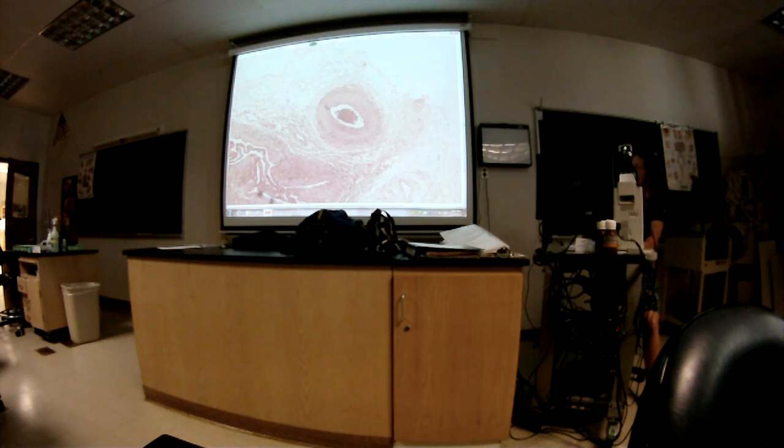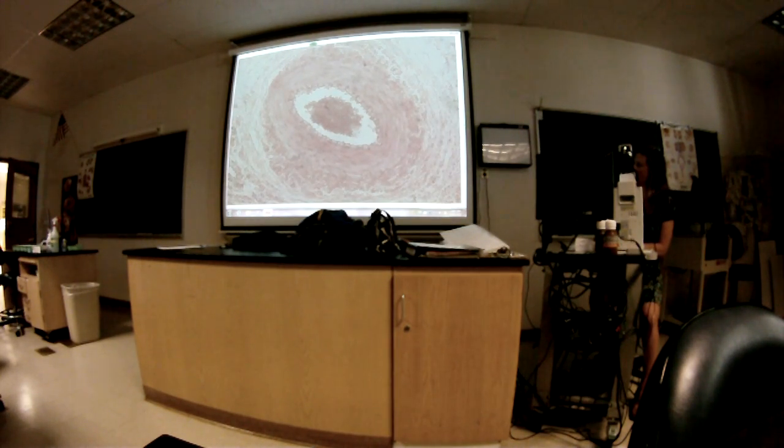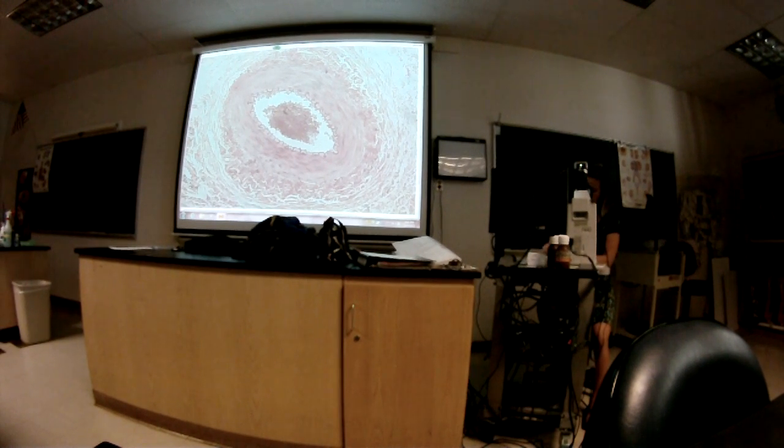What is that? Okay, moving in a little closer.